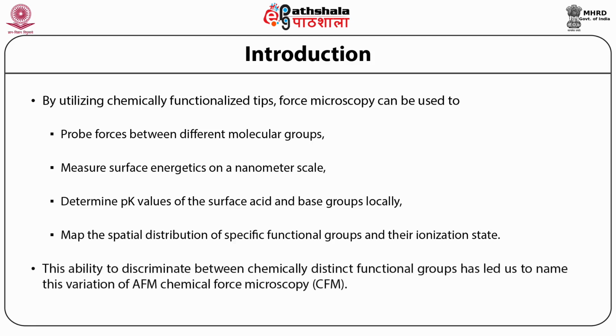This ability to discriminate between chemically distinct functional groups has led us to name this variation of AFM chemical force microscopy, written as CFM. Now comes the question of what is the necessity of CFM. Atomic force microscopy is an imaging tool used widely in fundamental research, although, like other scanning probe microscopies, it has provided only limited information about the chemical nature of the system being studied.